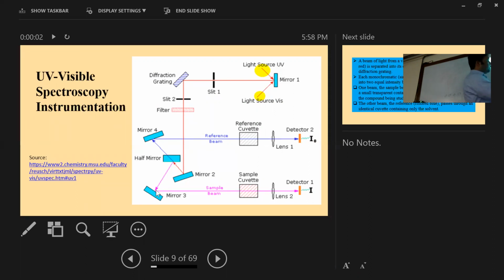Let us consider we had 50% here and 50% here, and the water is absorbing 1%. Then we will observe the light at the detector, something that can detect. This cannot really be represented as the human eye.